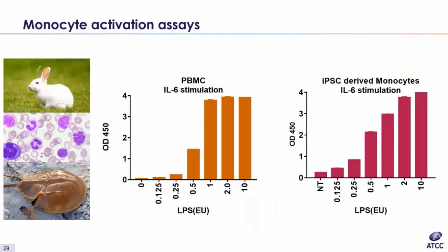So while it's nice that the data shows differentiation, I'd like to show you an example of how you could actually apply monocytes to something useful. In recent years, there's been a movement away from using animal-based tests. A good example of this is the various tests for detecting endotoxins, aka pyrogens, in parenteral preparations and biologics. These compounds can cause a robust immune reaction and fever, followed by severe shock and death.